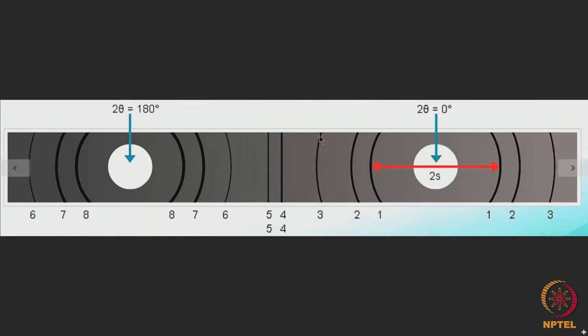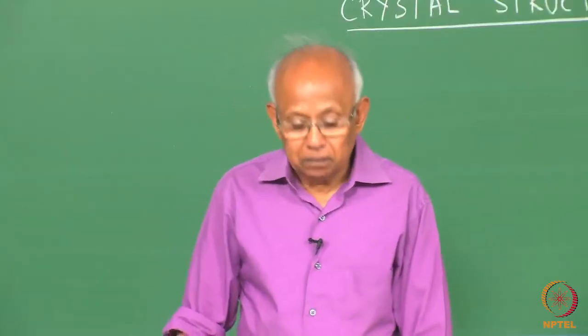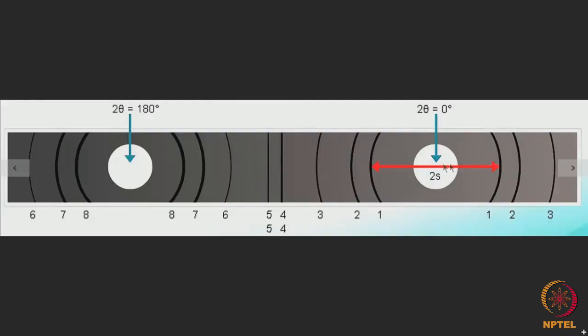This is the 3 3 line pair which is due to diffraction from a third HKL plane, etc., etc. So, the first thing to do is to measure the distance between any line pair.